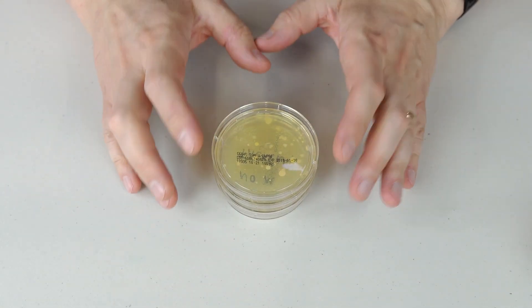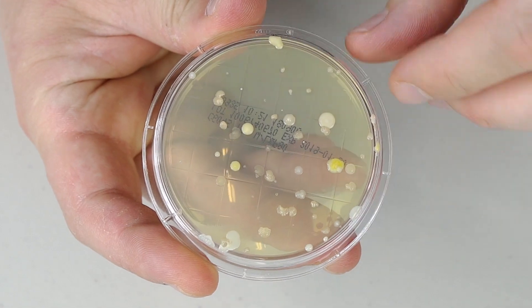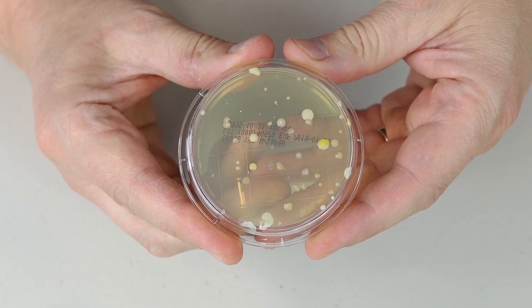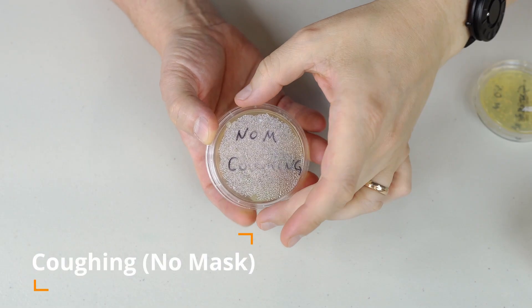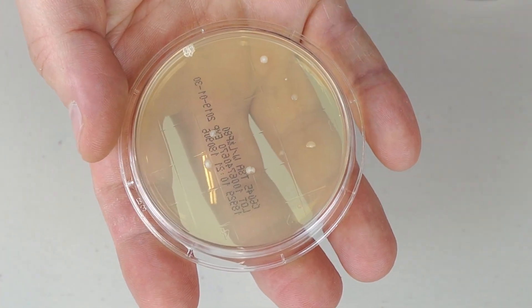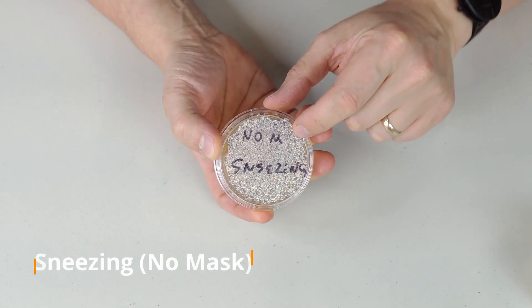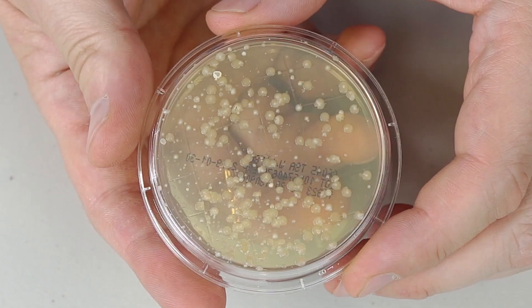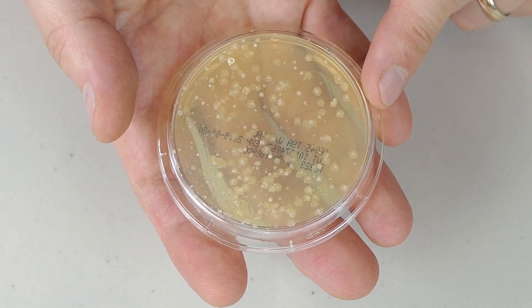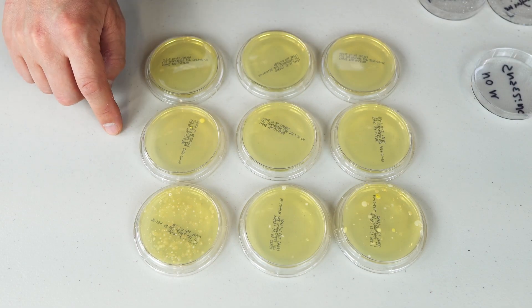And I'm very very interested about the one with no mask on. Let's see the talking one without any mask — oh look at that, crazy! Check this out — look how many colonies. Obviously different types of bacteria are starting to grow here. Pretty nasty, right? So many different bacteria. Let's see the coughing one without a mask. Oh wow — I'm surprised there's actually not as many, but it's still growing, quite a few of them, just not as many as with talking. Now let's see the sneezing one — oh, check this out, that is crazy. Basically the entire area of this petri dish is covered with bacteria, and a lot of the colonies are already fusing together. Oh, it smells bad. Mask, scarf, no mask at all — look at the difference.